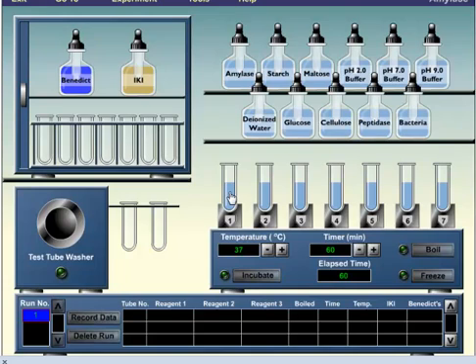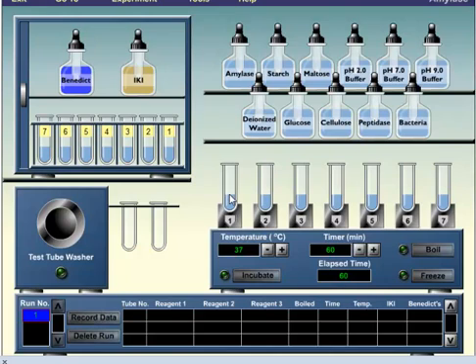Let's conduct this experiment for one hour. I'll take the content of this tube and put half in that tube, then I'll take this one and put half here, and take the second one, the fourth one, and the seventh one. Now each tube has half here, half here. Now this is iodine. If I take iodine and add it here, you see different colors.